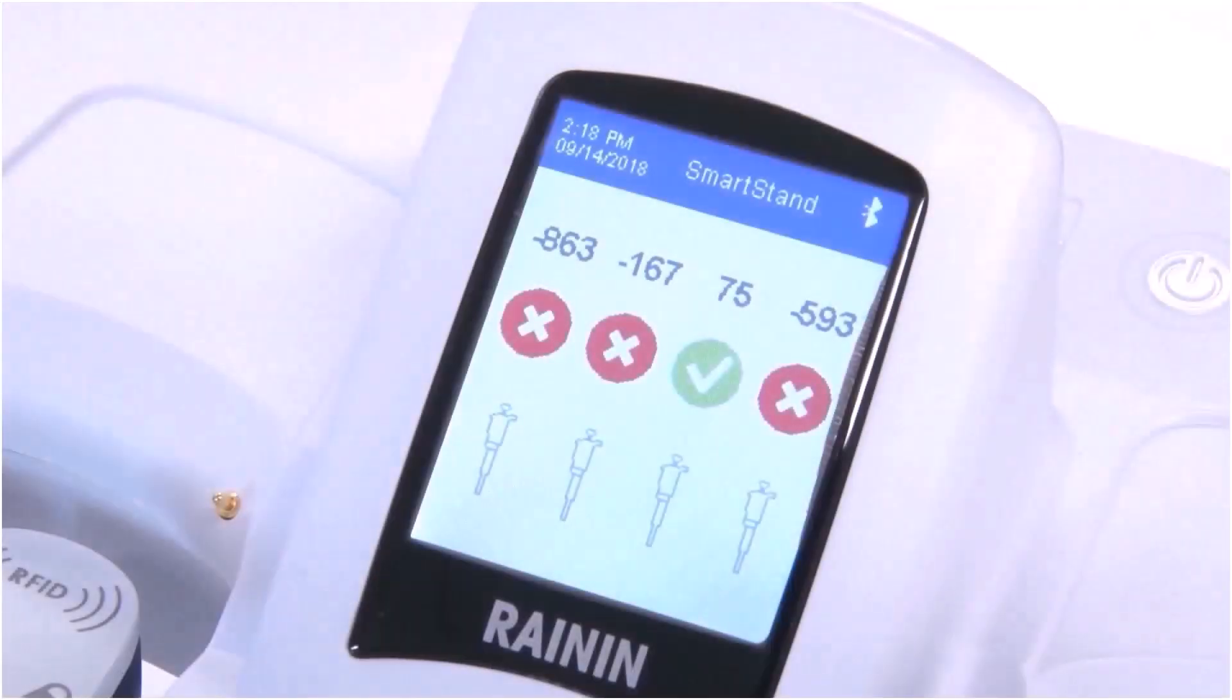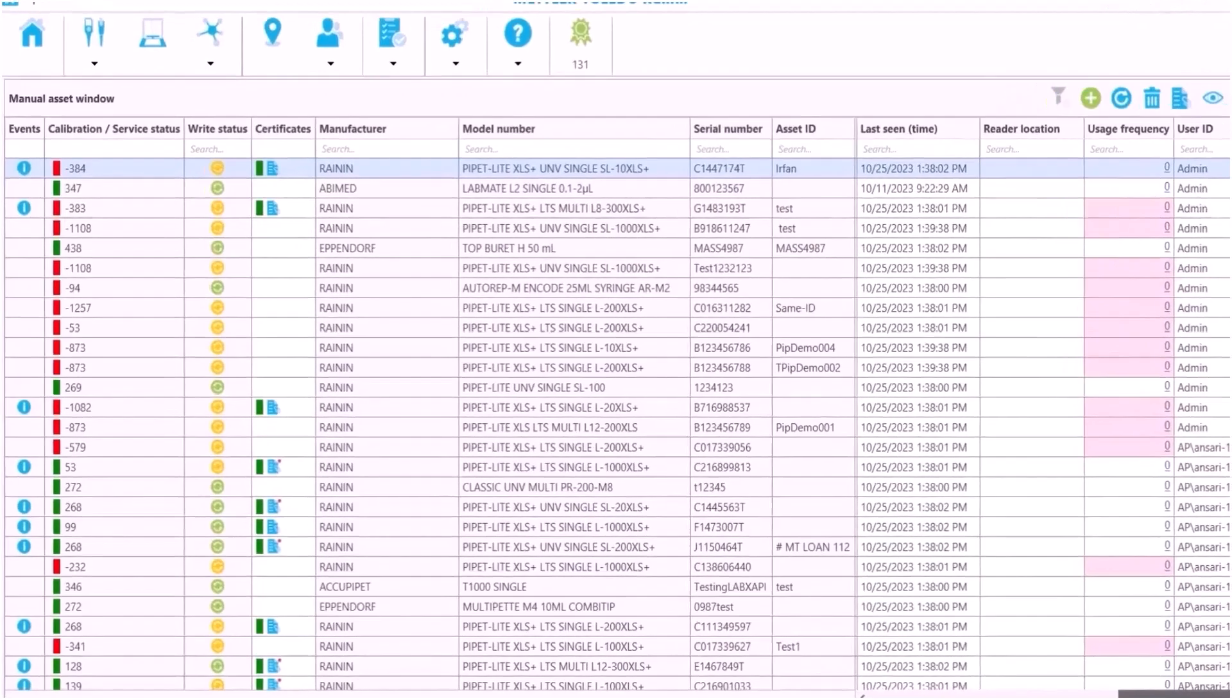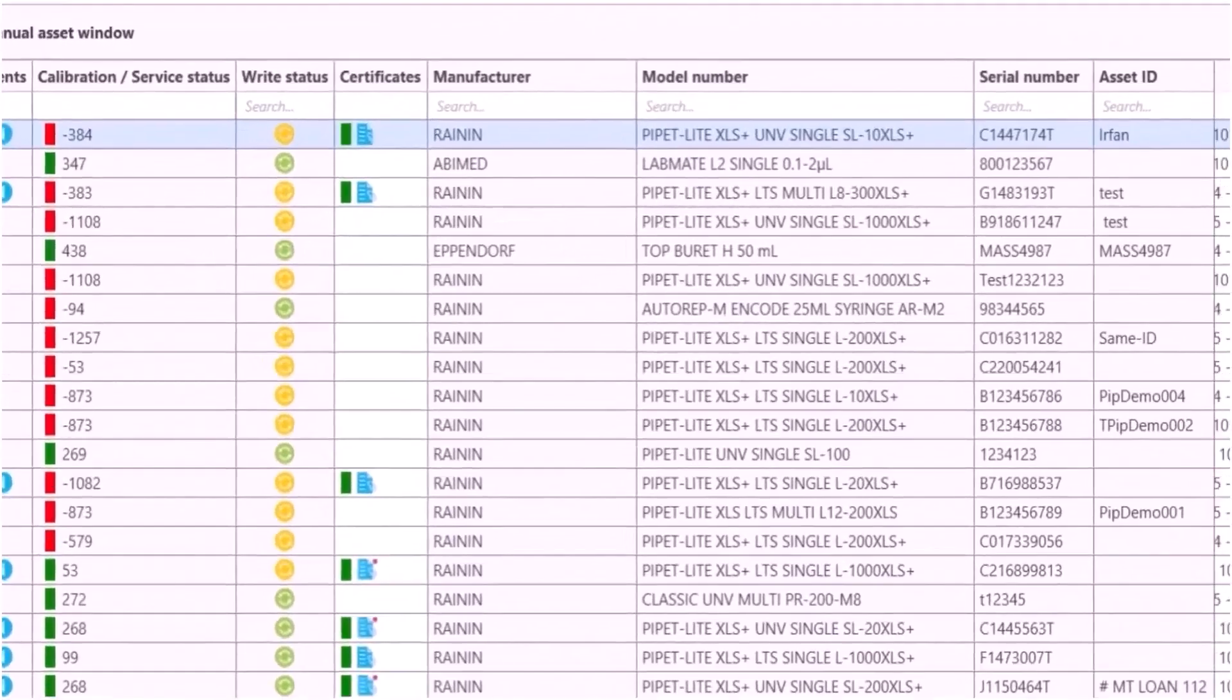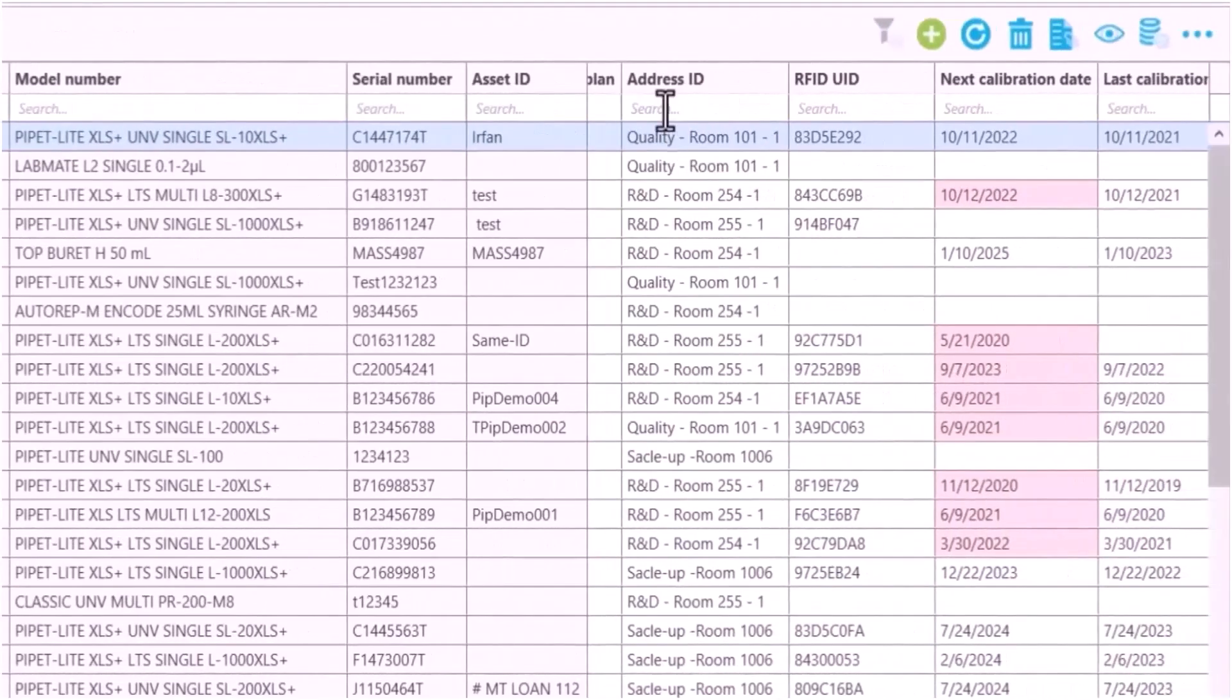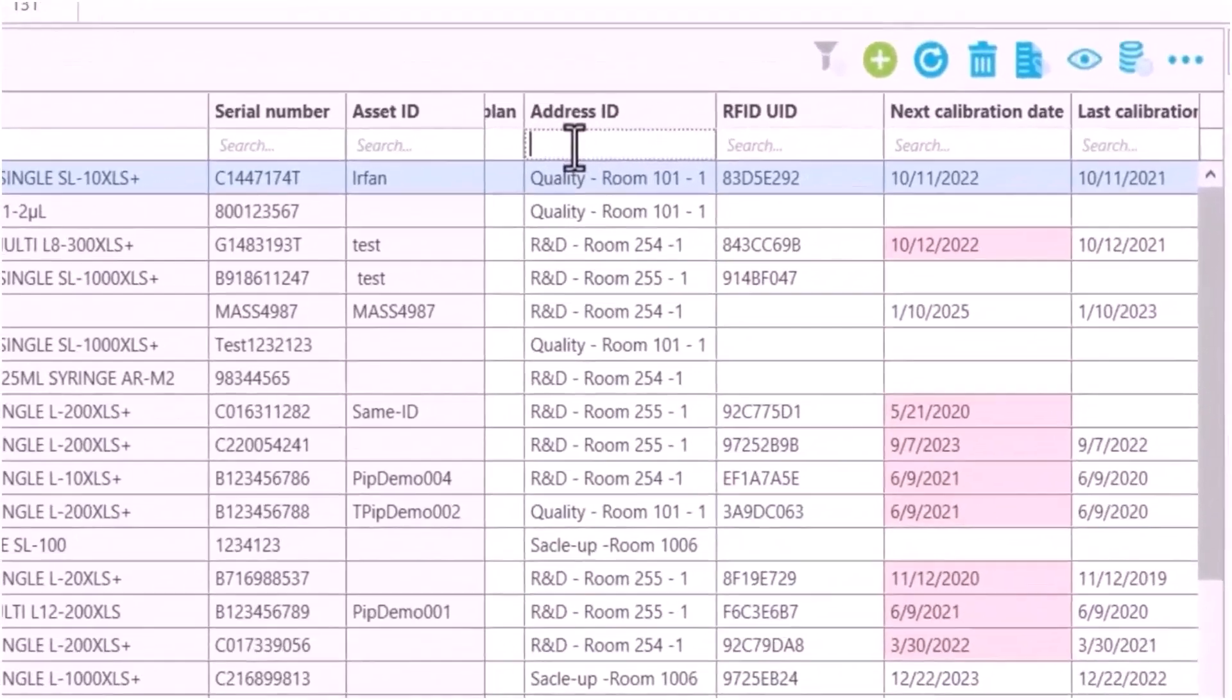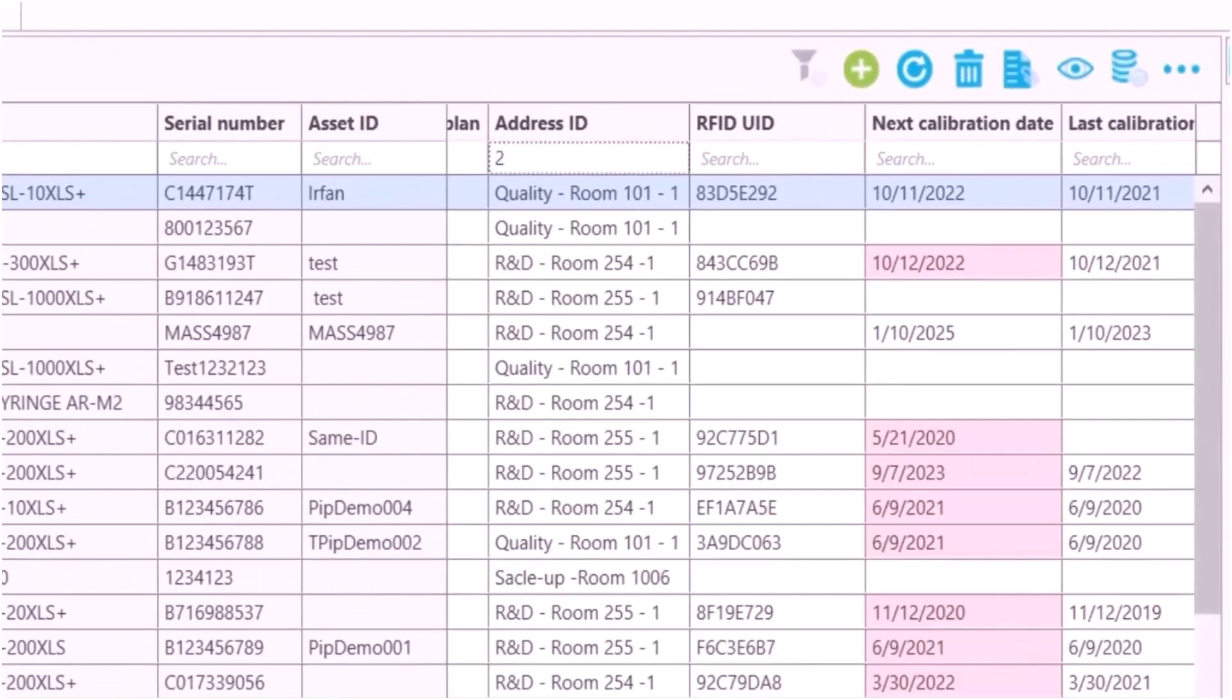Ideally I want everything to be green. I can filter by group or any other identifier by typing in any column's top row.